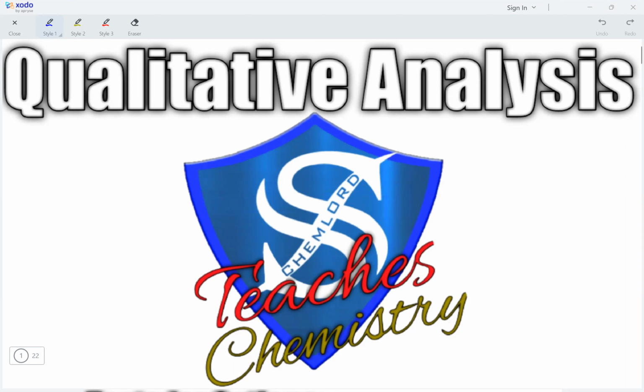In our test for cations, we had the production of ammonia gas which we tested for with a damp red litmus. In a test for anions, we had the production of ammonia in the test for nitrate ions, in which ammonia gas turned damp red litmus blue, and we had a test for sulfur dioxide in testing for sulfite ions, in which the sulfur dioxide turned potassium manganate 7 from purple to colorless.